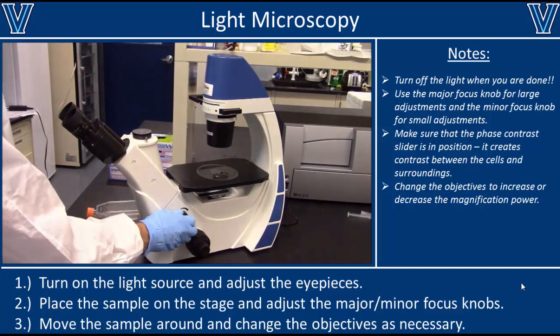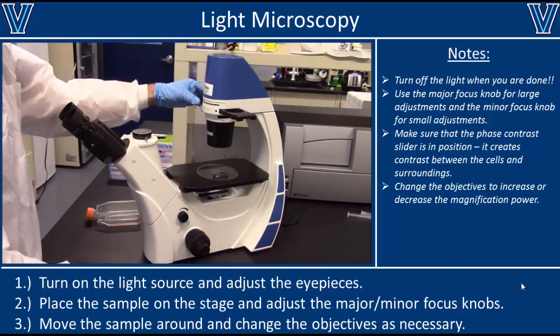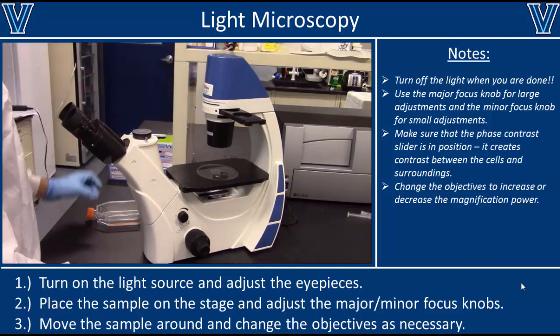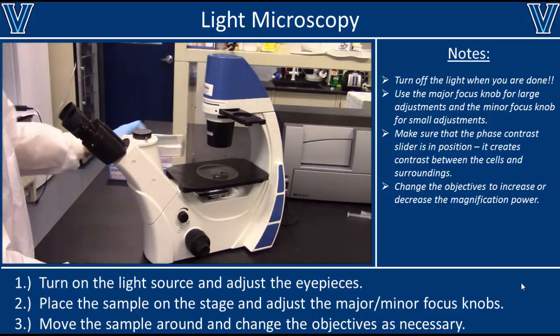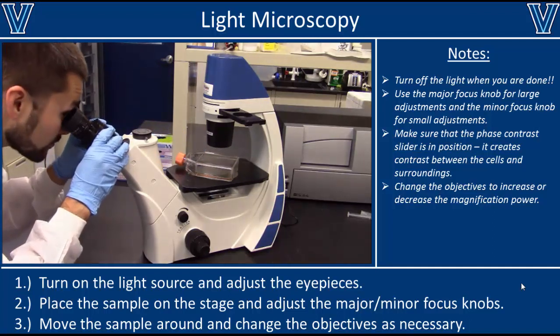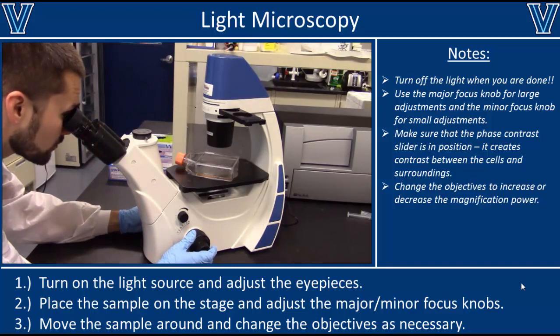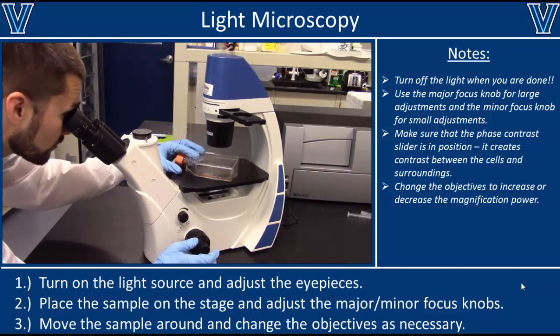To use this microscope, start by turning on the light by rotating the light knob. Then push the phase annulus into place. Next, place the specimen on the platform. Take off your goggles and look through the eyepiece to the sample. You may need to adjust the focus. This microscope has 2 focus knobs, a major and a minor focus, as shown here.